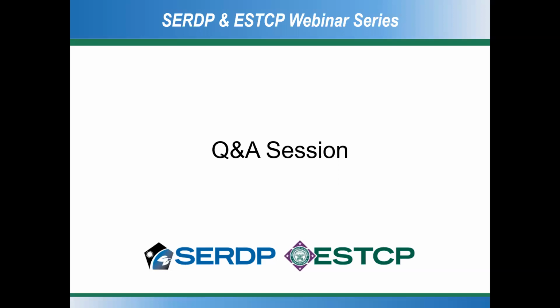Great, thank you. And the last question for you is from the US EPA. Can you discuss possible cross-contamination for normal PFAS sampling at groundwater sites? There's the potential for field reagent blanks. Is there a similar approach for blanks when relying on PFAS passive samplers?